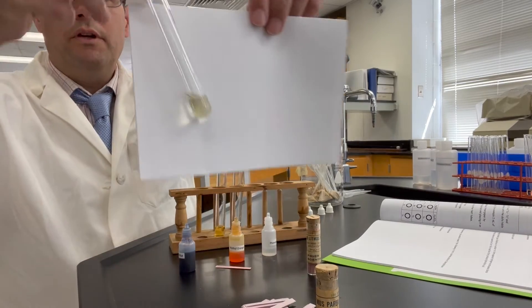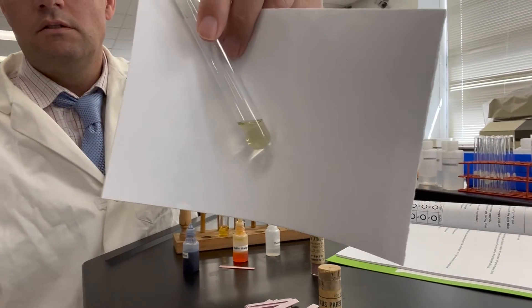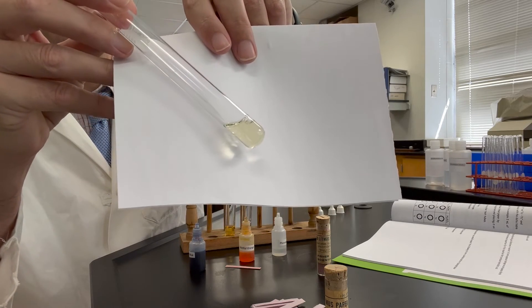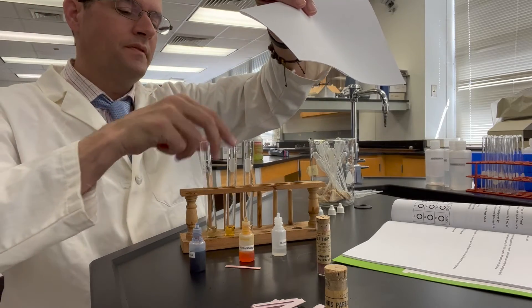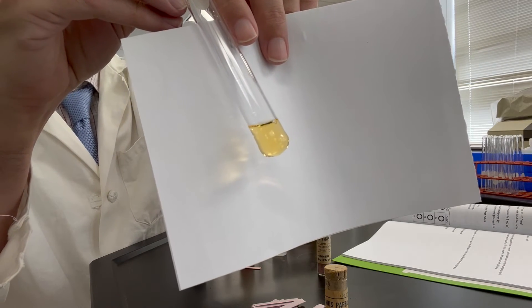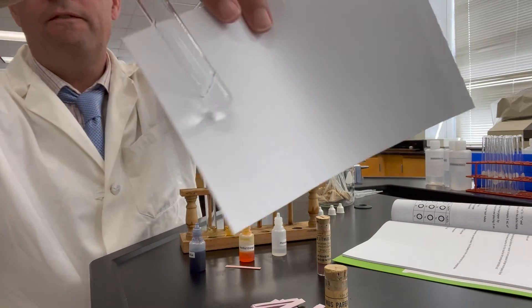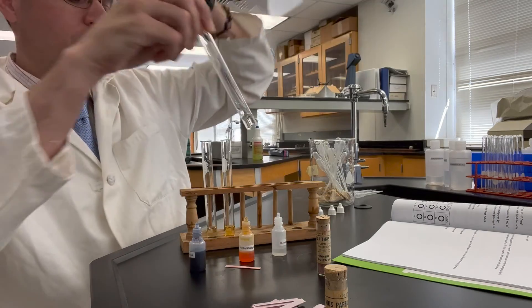Here's ammonium chloride with thymol blue — you can observe that there. Here's methyl orange and ammonium chloride. And here is phenolphthalein and ammonium chloride.